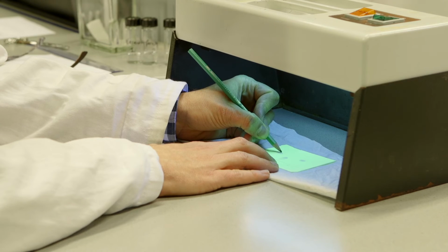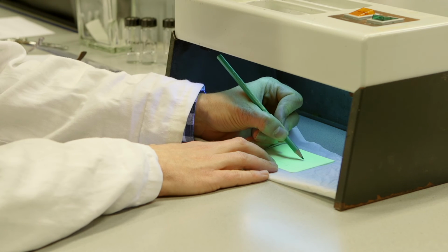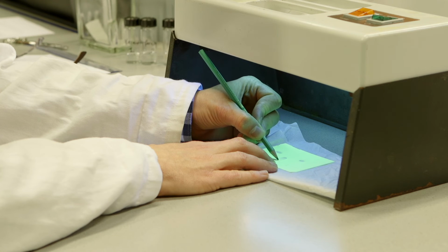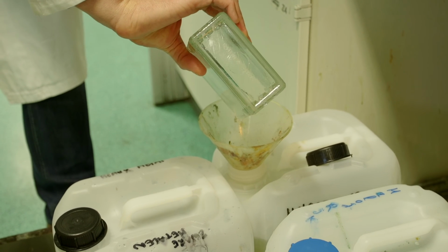With a thin pencil line, the circumference of the spots is traced. This is best done with a long pencil so that the skin is not exposed to radiation. From the distances that the substances have travelled up the plate, the RF values can be determined. The RF values of the sample can then be compared with the RF values of the reference substance.